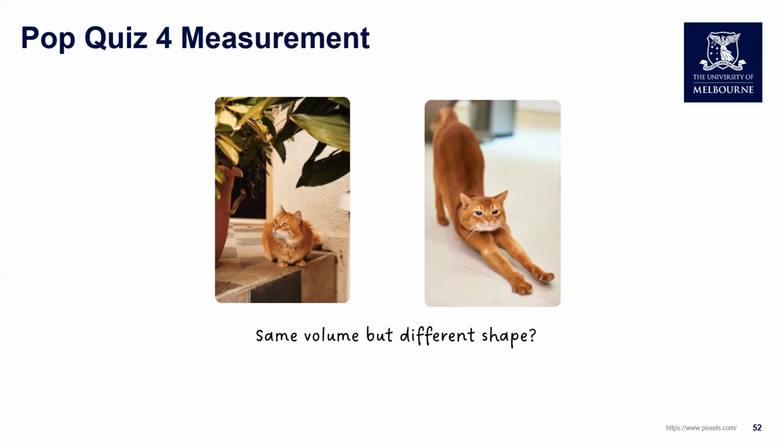For the second one, select the correct description of colocalization analysis. It's a multiple answer question, and yes, it doesn't measure the interaction of two molecules. If you want to measure actual physical interactions, it's better to use different microscopy techniques like FRET. But in the image analysis space, when people refer to colocalization, it measures the correlation of pixel intensity like Pearson's, or it measures the general proximity of molecules like Manders' and object overlap.